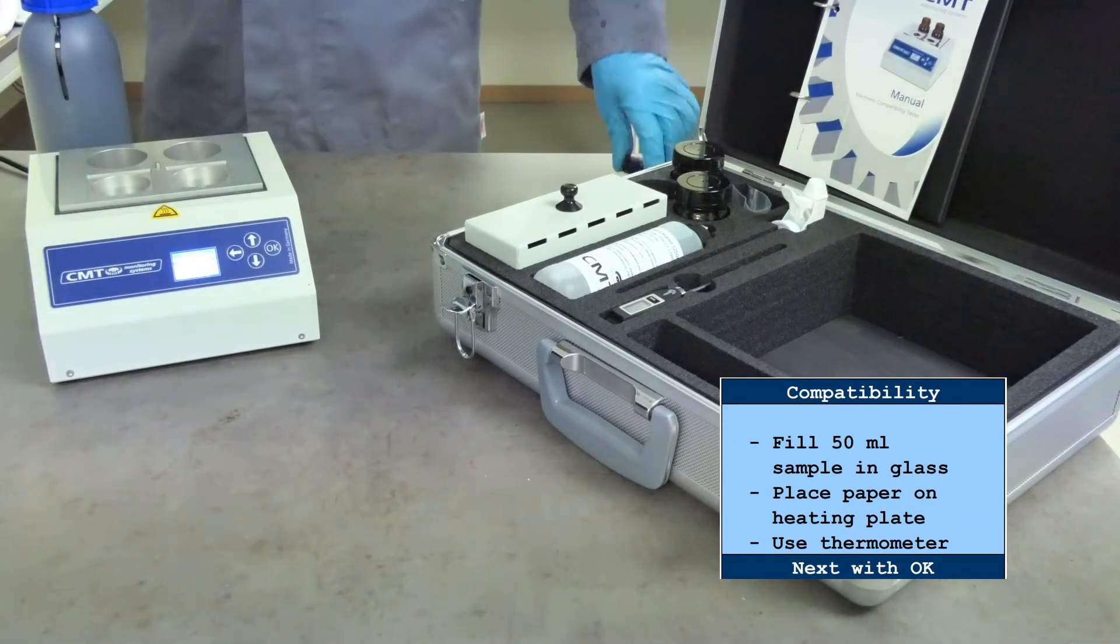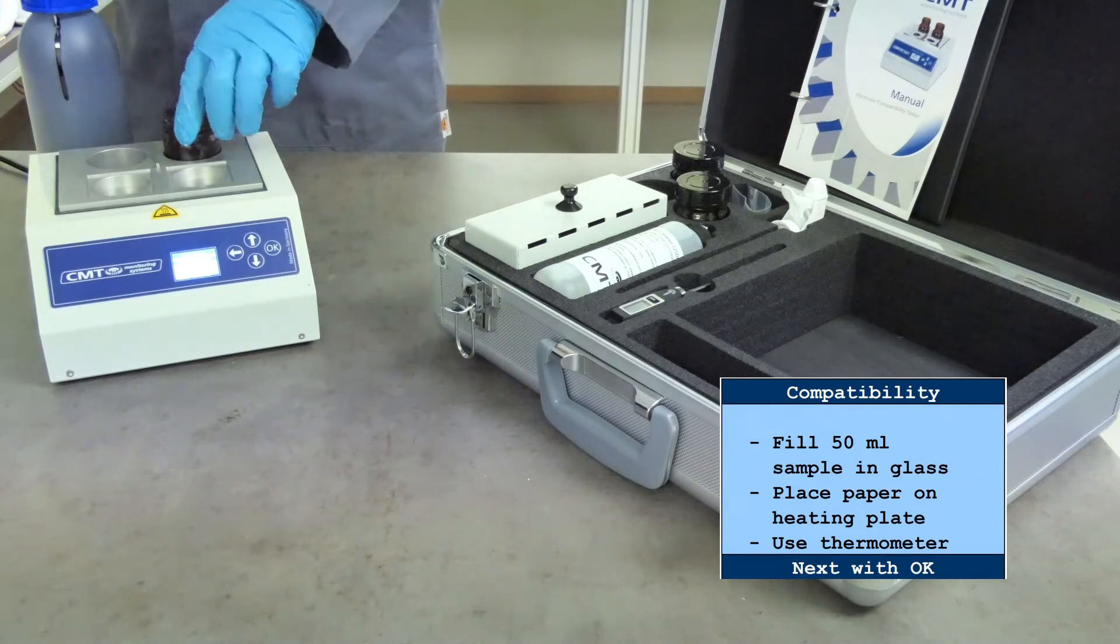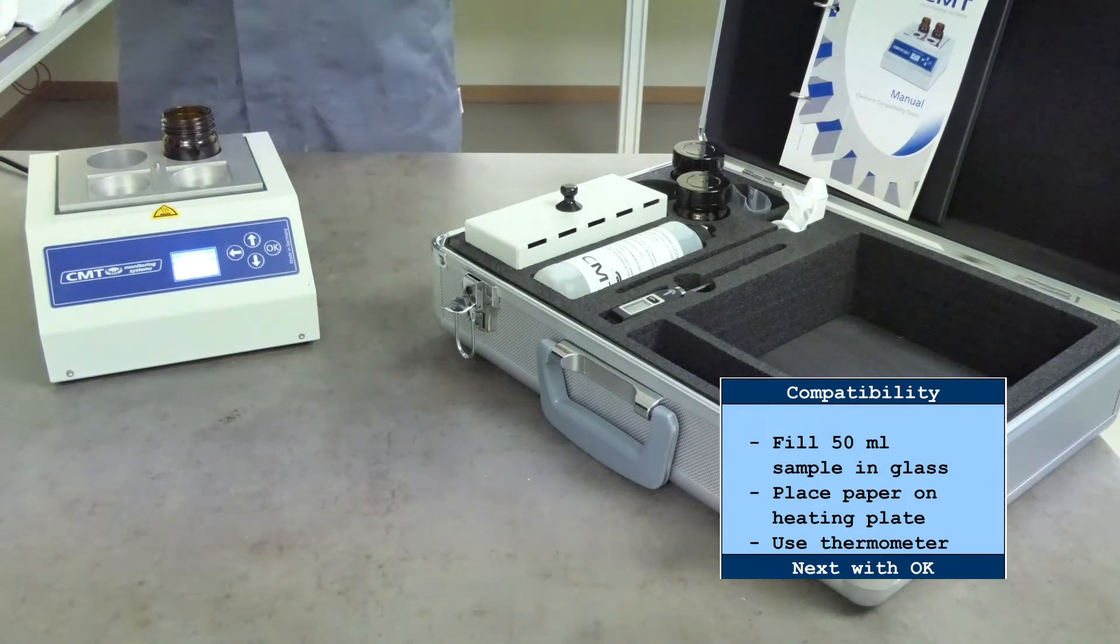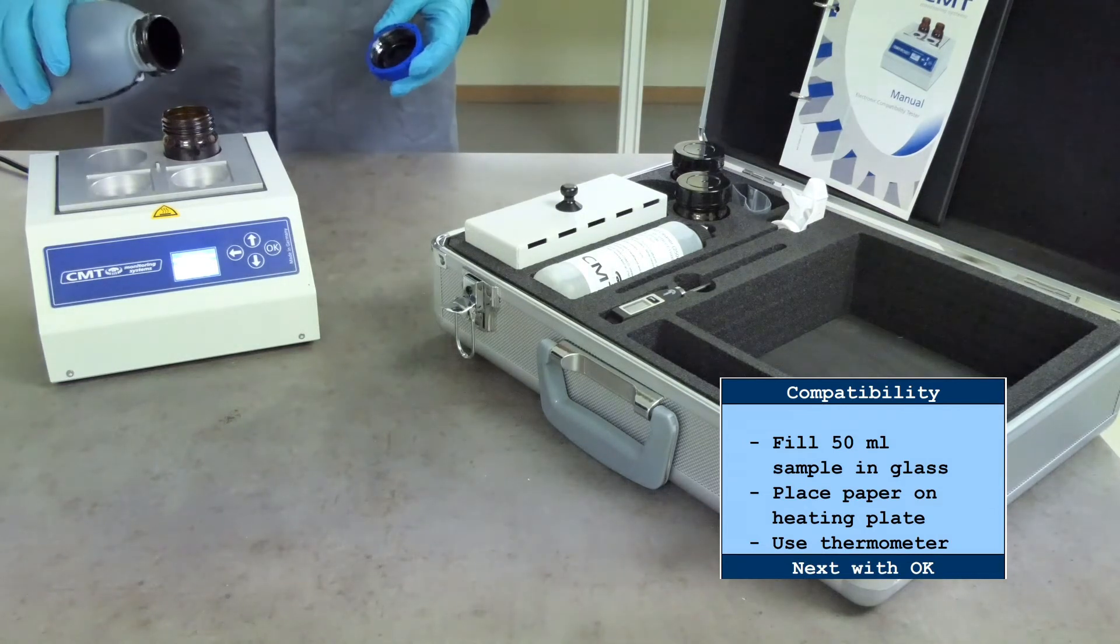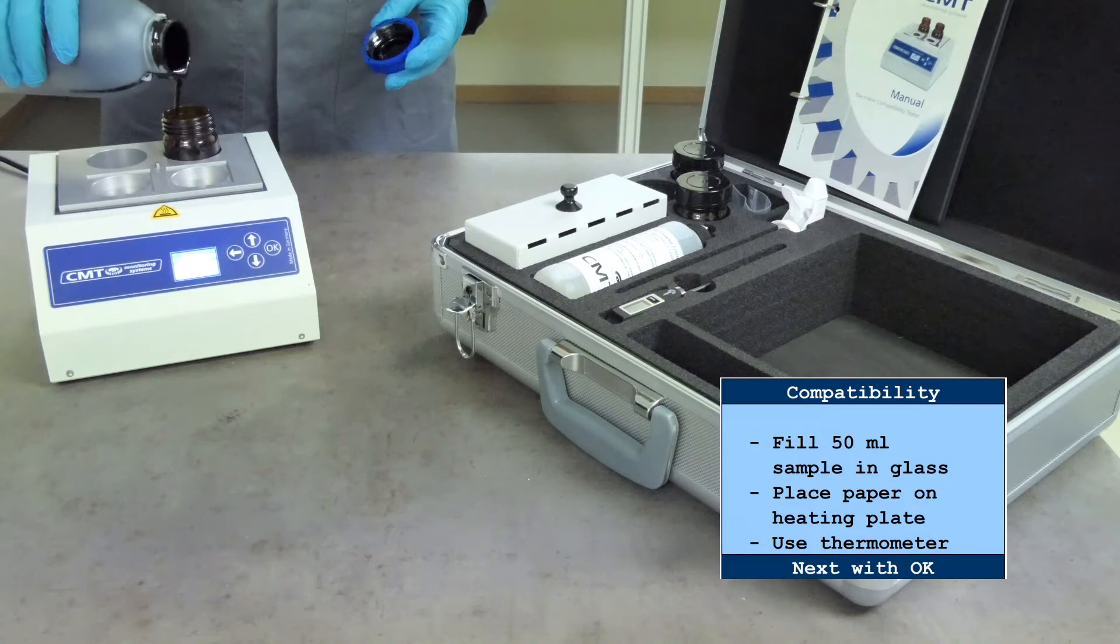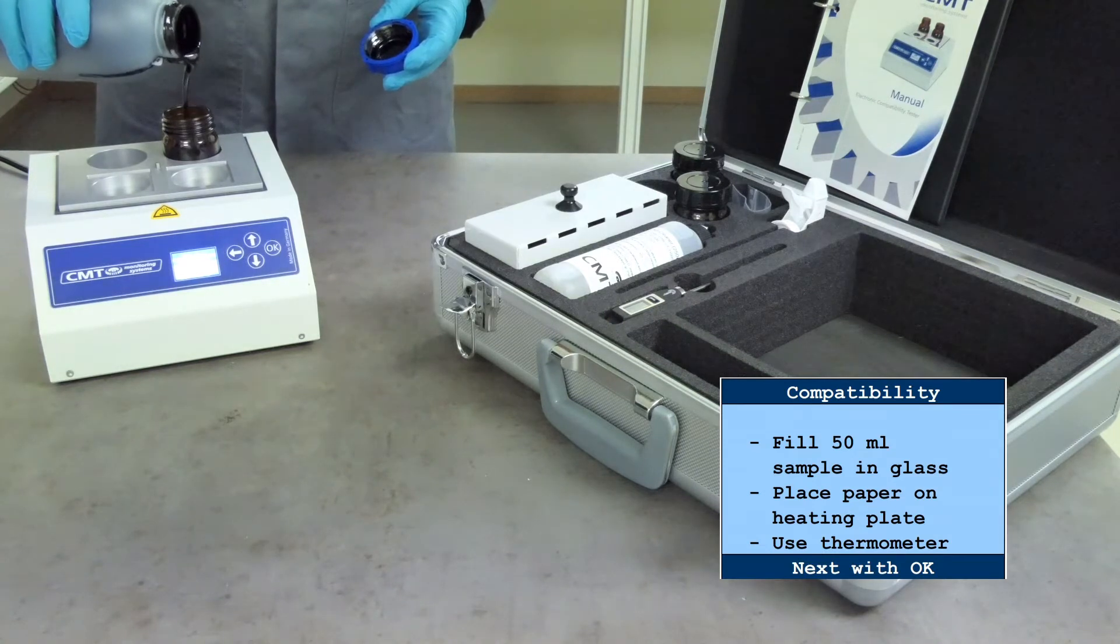Insert a glass bottle into one of the round cavities of the electronic compatibility tester. For a stability test, pour about 50 ml of sample in the 100 ml glass bottle.